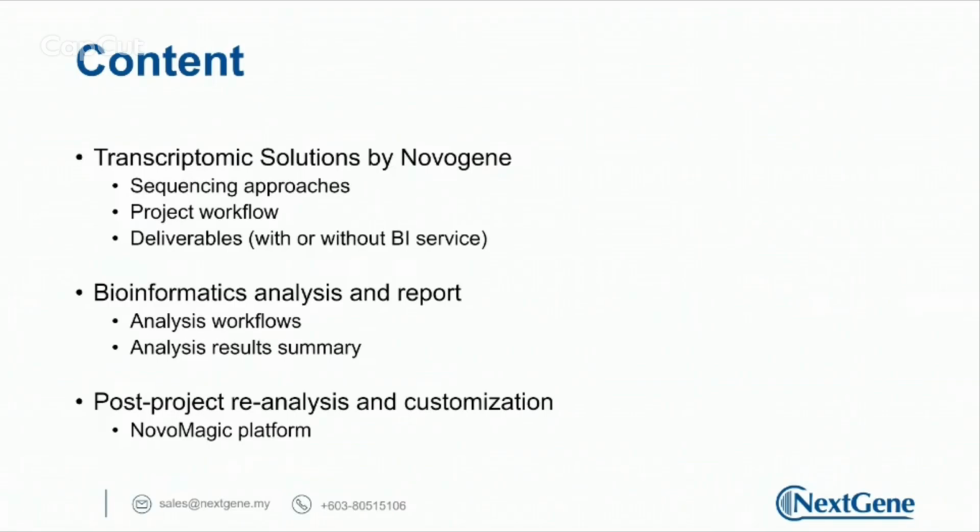Here I'm going to introduce some sequencing approaches or the applications that are available here, how we handle the projects, and what are the files or deliverables that will be received at the end of the project. And then we will be going through a demo report to show you what analyses will be carried out for the mRNA sequencing, and whether it achieves the project objective.